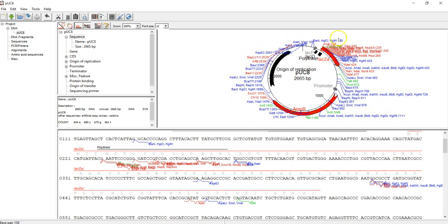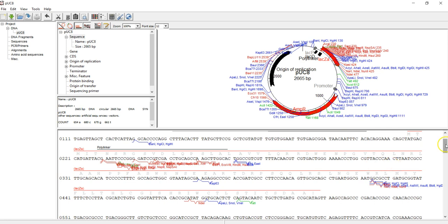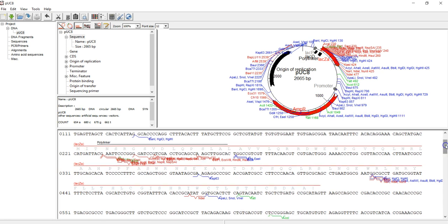Then you go to the graphic panel. You will see there's so many restriction sites showing, but some of these are not useful—we're not using them all.